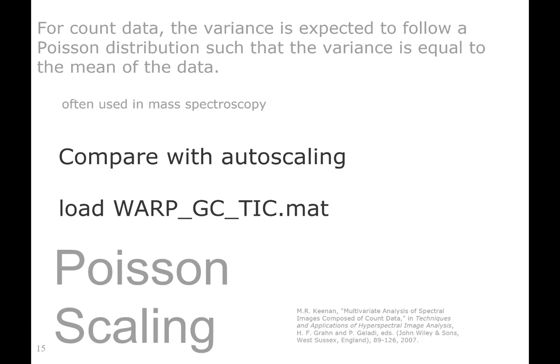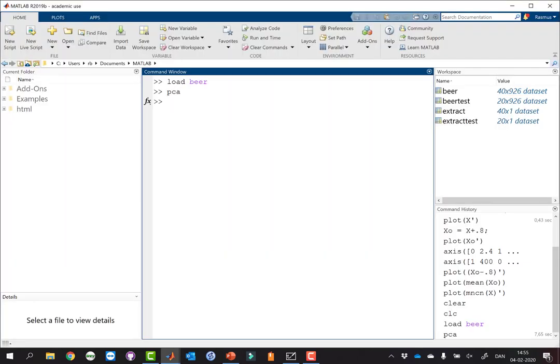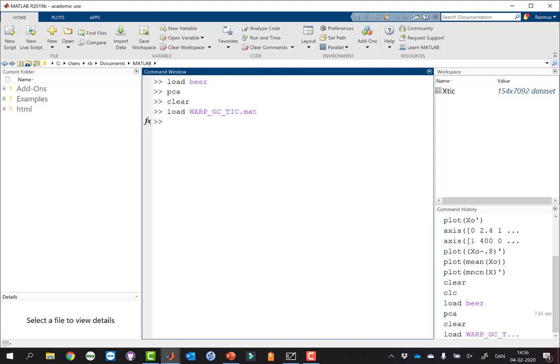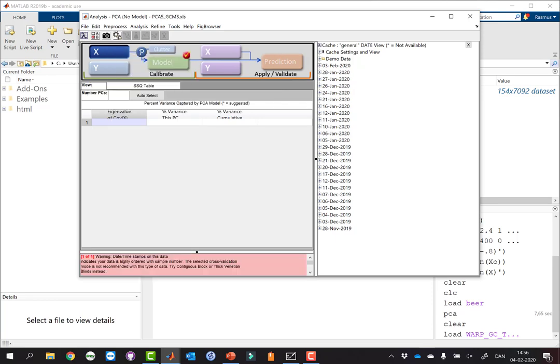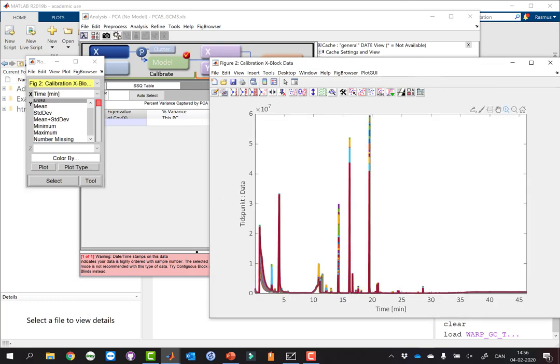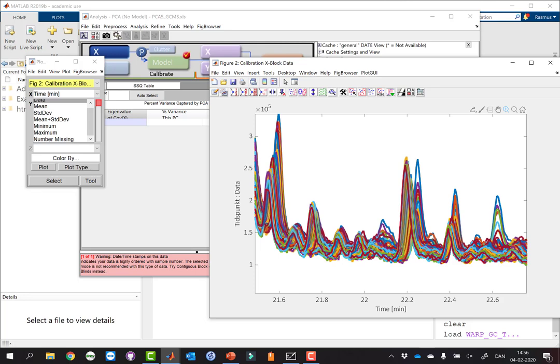Poisson scaling is related to count data and is often used in mass spectroscopy or Raman spectroscopy. Let me load a chromatographic data set — it's 150 samples and 7000 variables. You can see we have some very big peaks but also some very small peaks, and we'd like to look at all of them. Let me go into the advanced pre-processing and try auto scaling — as expected, the noise becomes much bigger than the peaks.